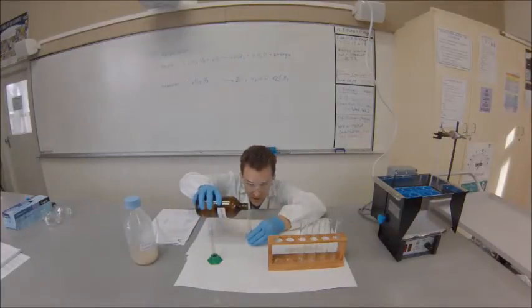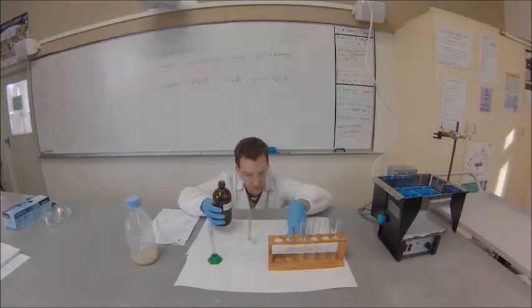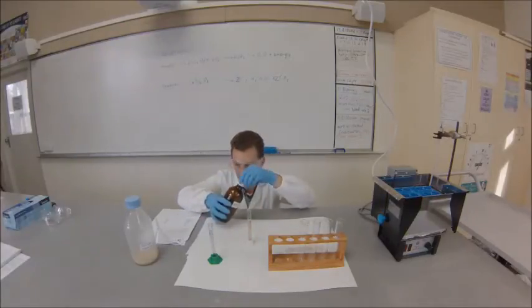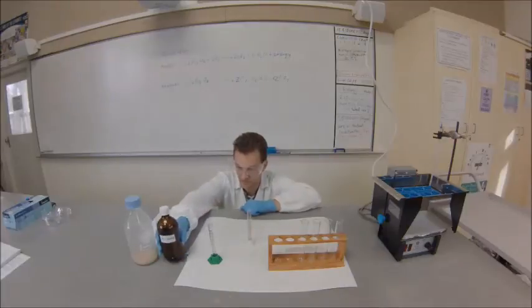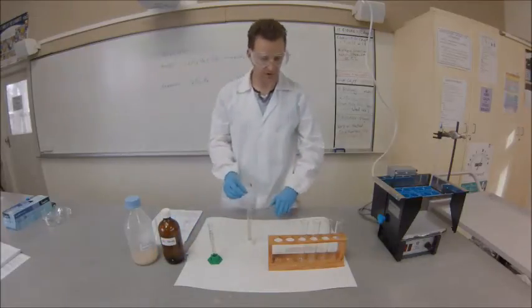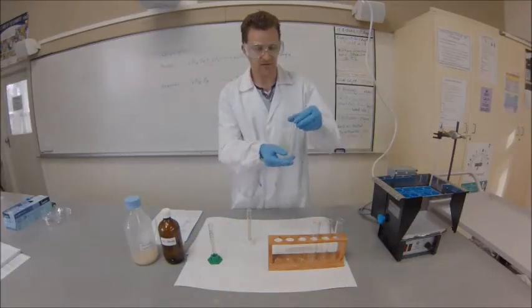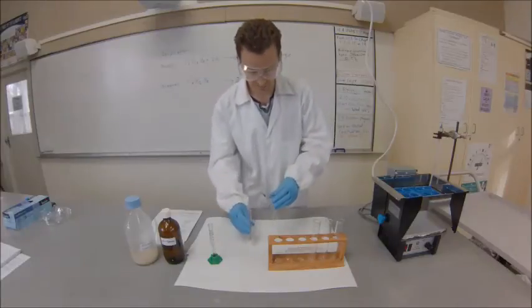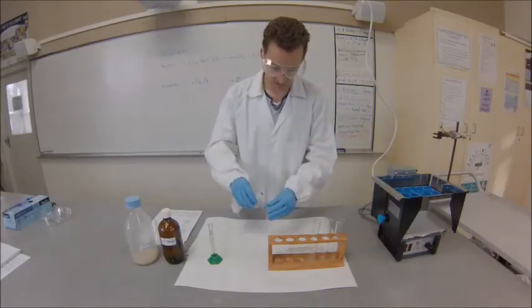We're going to put that into one of our test tubes and sit it in the water bath to get it to the temperature we want for the reaction. The idea is to have it already at temperature so that for the entire 10 minutes we're collecting CO2, it's at that temperature.